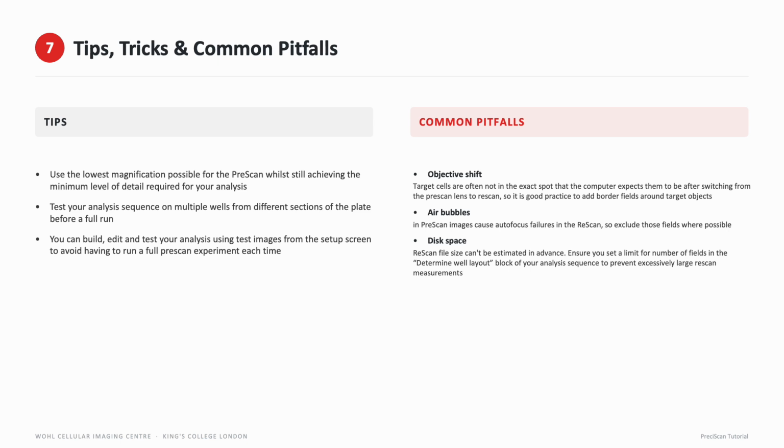You can also build, edit, and test your analysis using test images from the setup screen, so you don't have to run a full pre-scan experiment each time. You can do that by just pressing test images. Once your test images are loaded, click straight into the image analysis screen and it will load with those test images rather than requiring you to run a pre-scan.